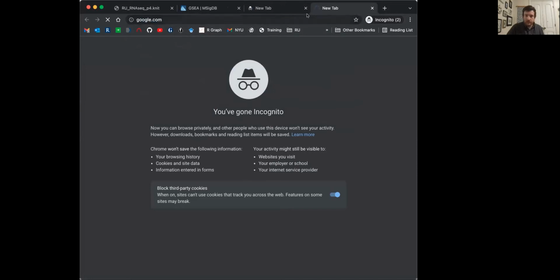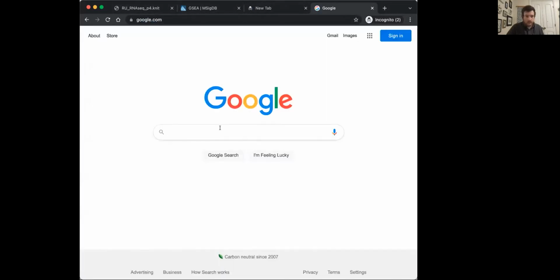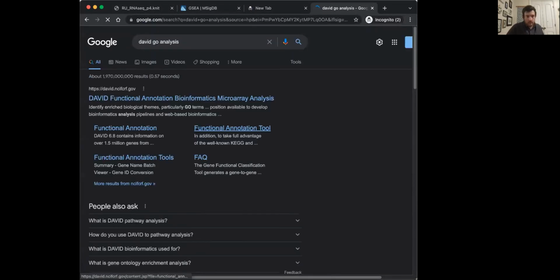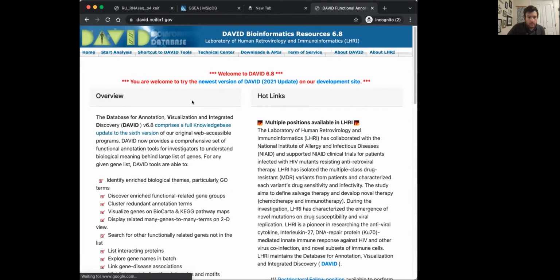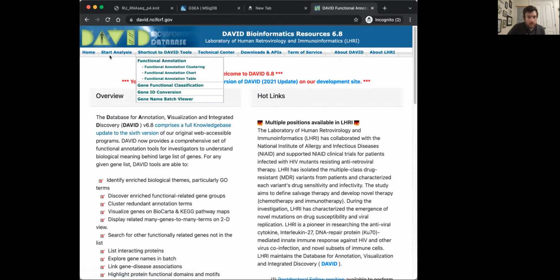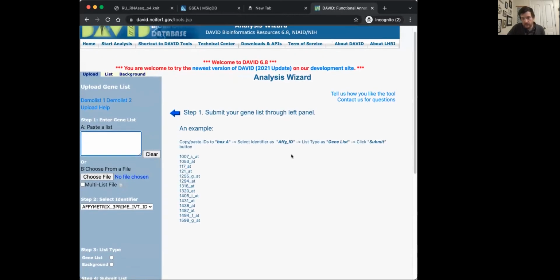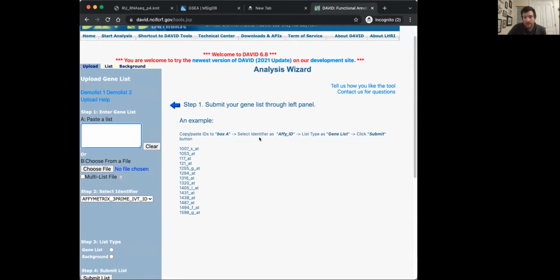Oh, I forget that my internet has been terrible. So yeah, we can start doing an analysis. I can paste a list. I can do stuff through here. This is, I'd say, most of the time how people do this.